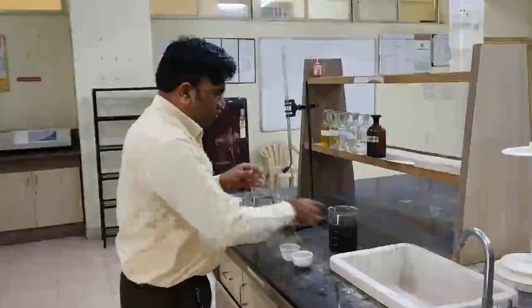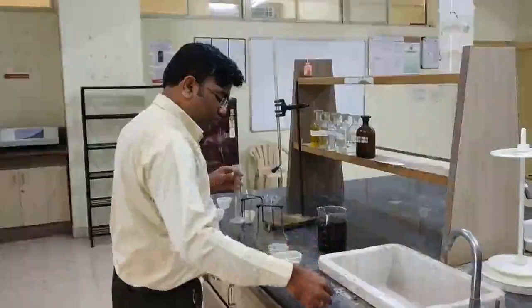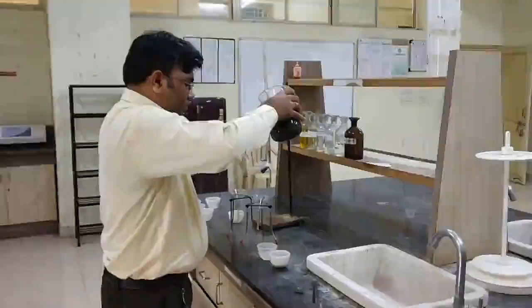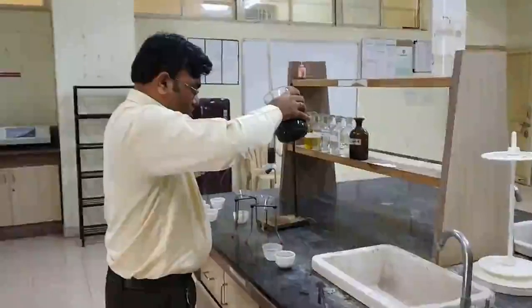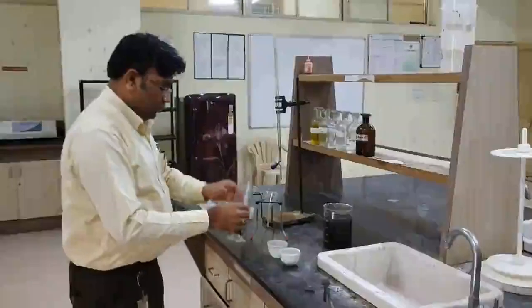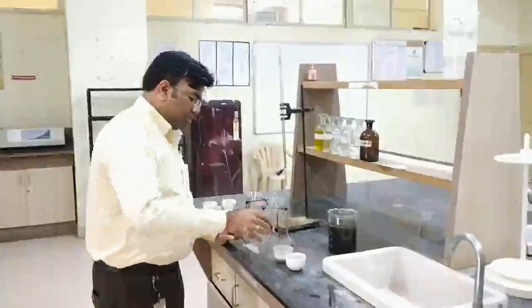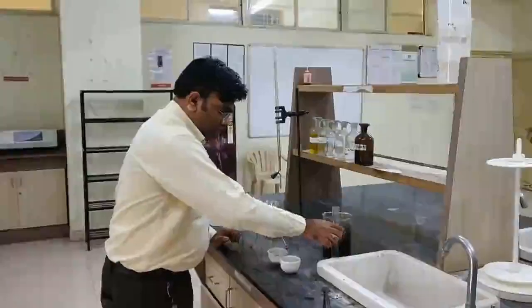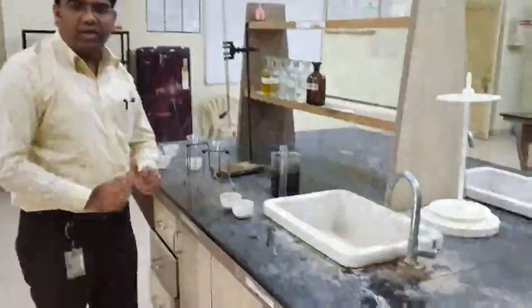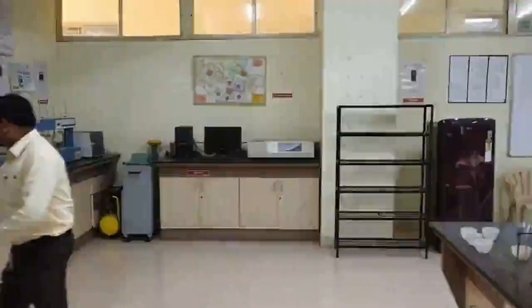Similarly, I will be measuring the sample after stirring. 25 ml of sample is to be measured, and it will be put in the crucible A. Now these are the samples which are ready for the determination of the total solids. So we are going to perform the experimentation of the total dissolved solids as well.